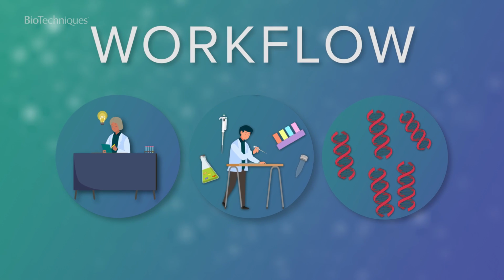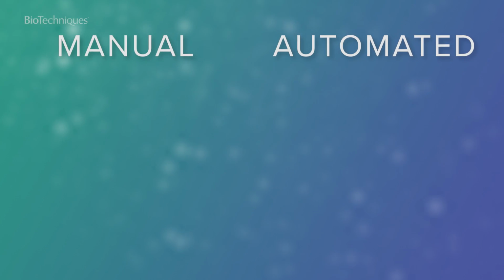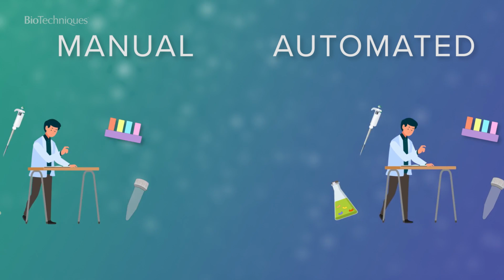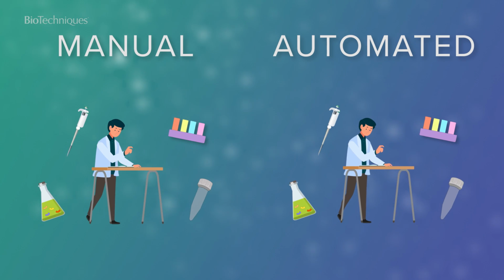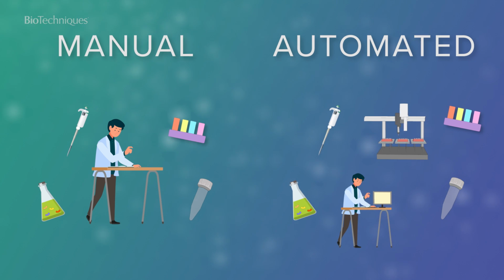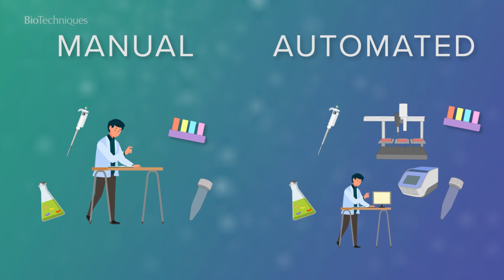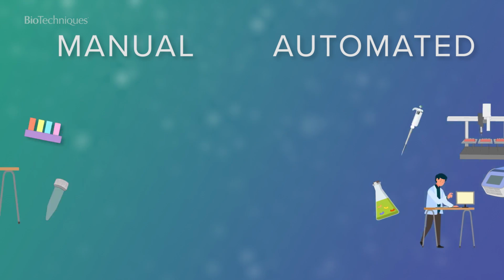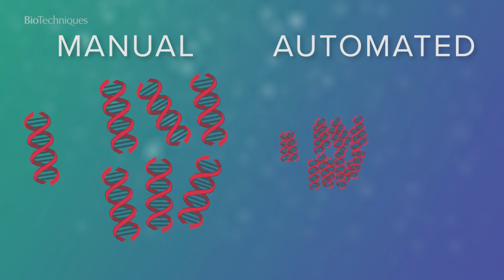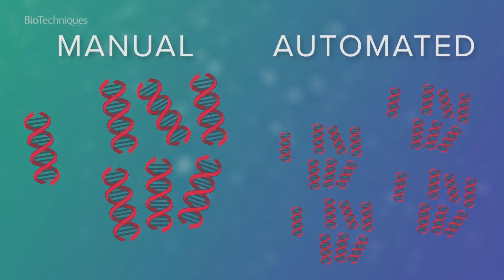So what does a PCR workflow look like with lab automation? The planning stage remains the same, as automation is not chemistry dependent. For our resources, we would still need the primers and enzymatic cocktail. However, an automated liquid handler would replace the manual labour, and we would need a thermal cycler compatible with the throughput of automation. The goal remains unchanged. However, with automation, there should be a view to increase the throughput and consistency of the results.